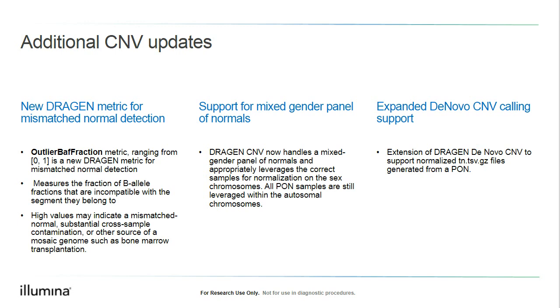Also, we have expanded the support for de novo calling for CNV. So again, if you're using whole exomes or whole genomes to do CNV calling, then there is expanded support for trios to do de novo calling.